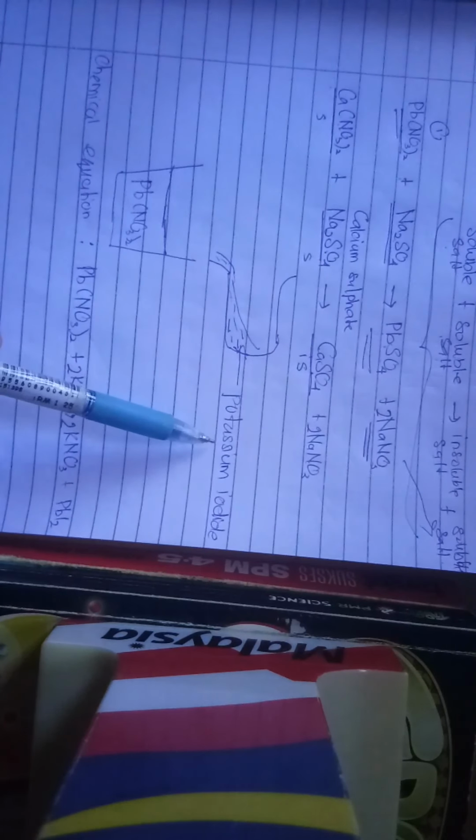For example, in this cup, I put lead nitrate. In this cup, I put potassium iodide. So the chemical equation will be lead nitrate plus potassium iodide. Which salt will I get? I will get lead iodide. Iodide is basically almost similar to chloride. You learned that all chlorides are soluble except PbCl2, lead chloride, so lead iodide also will be insoluble.